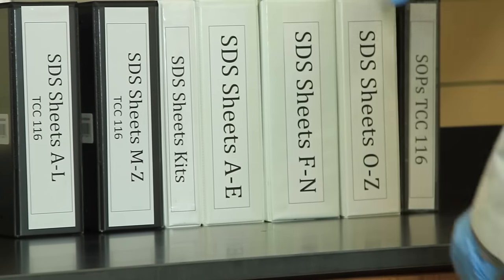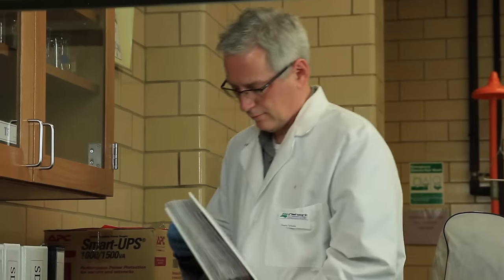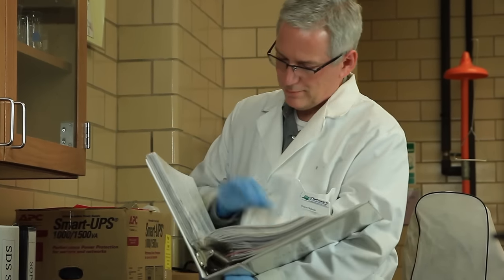The safety data sheet is a one-stop shop to find out about a chemical's properties, hazards, and safety precautions. Know the location of the safety data sheets in your lab and review them before working with a chemical for the first time.